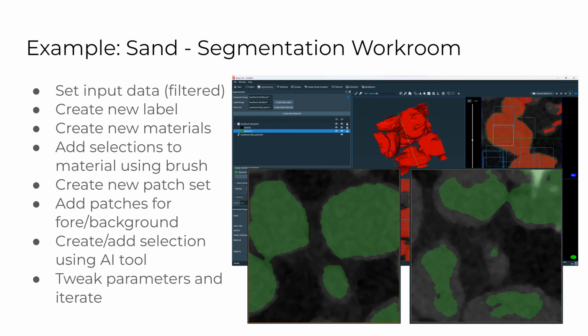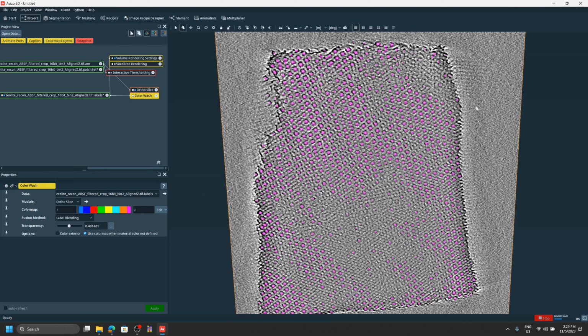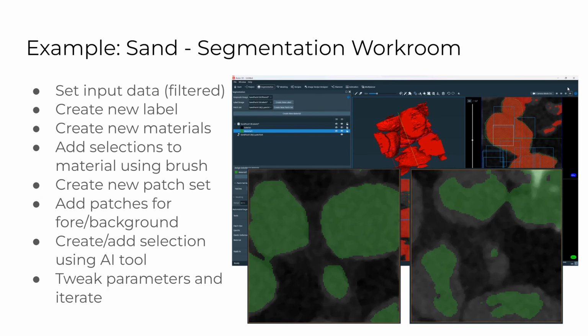All right, so I hope everyone agrees that for some cases this is actually pretty cool. And you are going to work on the next one if you want. But I wanted to show this. This is the sand data set that I was using in the very first example. We've seen that clearly, at least for me, thresholding works really well, because it's super easy to separate the sand from the air using the intensity values.